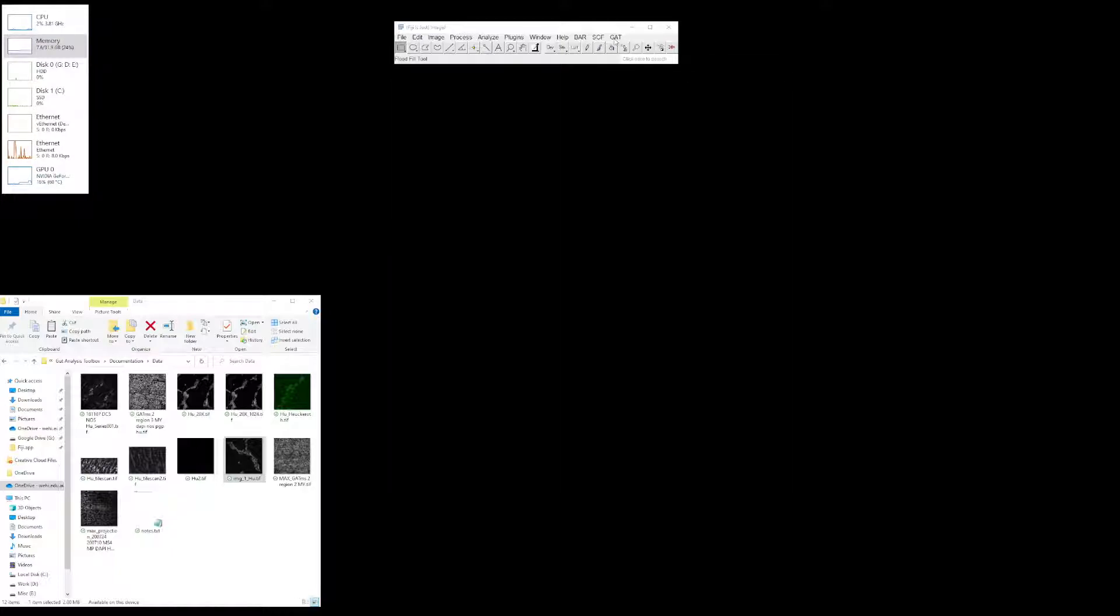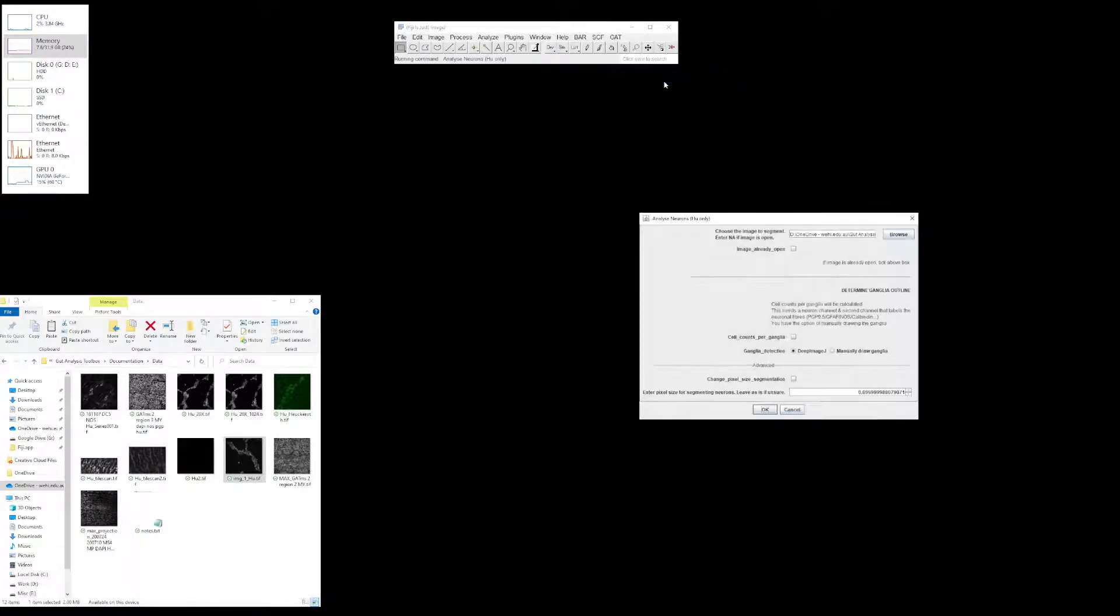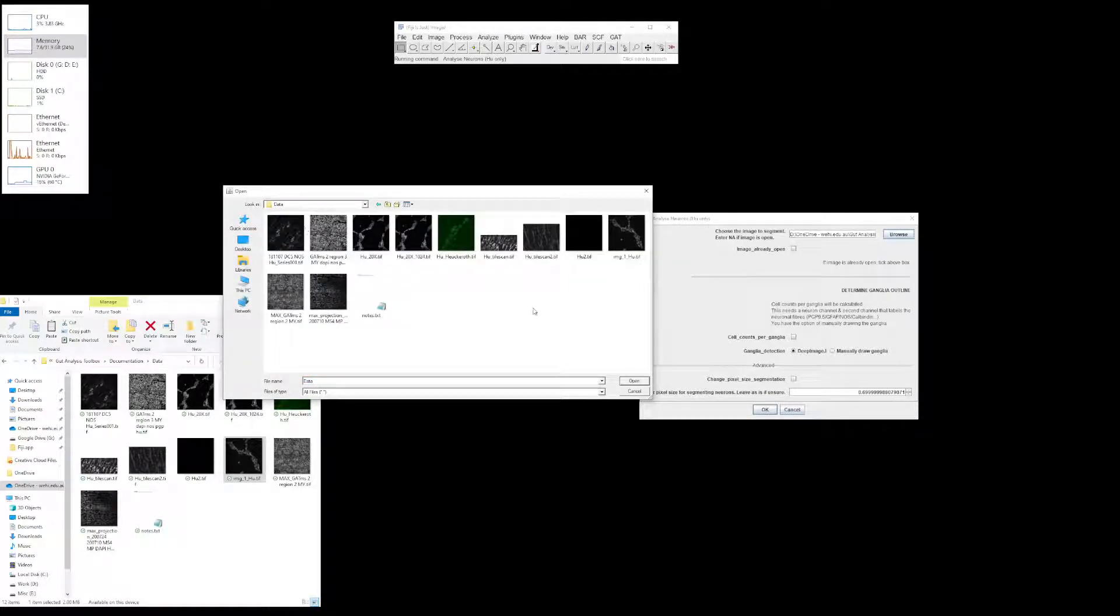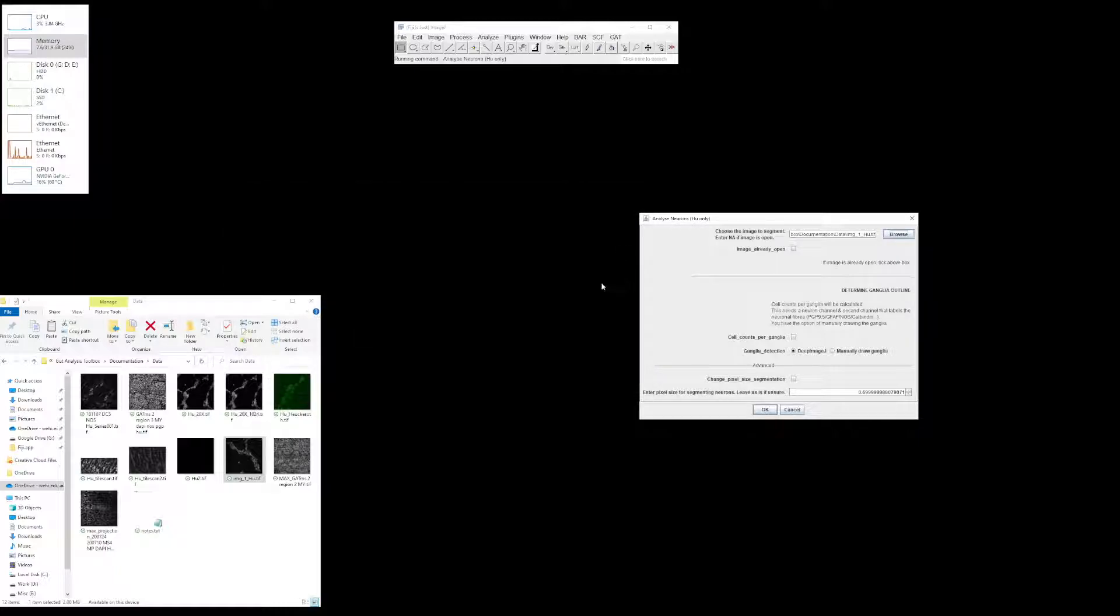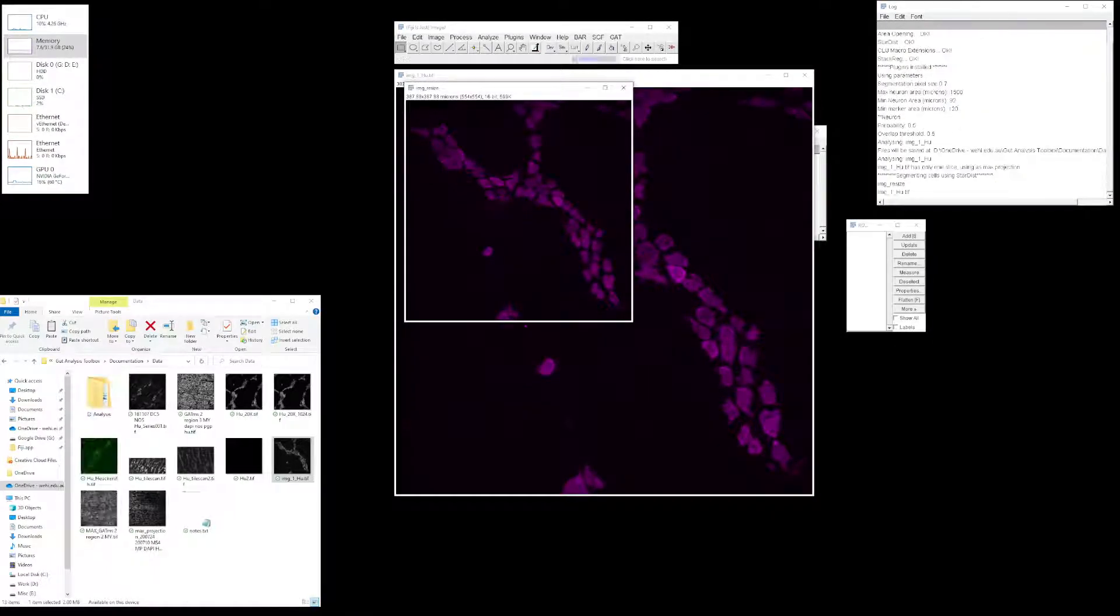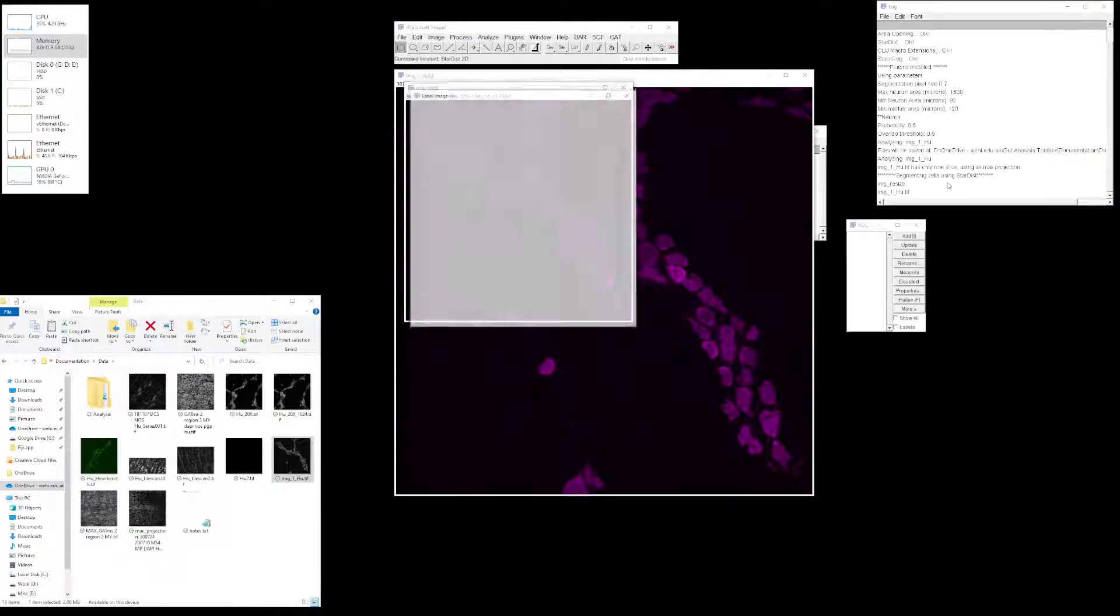If you want to run the segmentation, click GATT, click Analyze Neurons Hue only, and select the image location. You can see there aren't any folders here, but when you start running the analysis, it will automatically create a folder called analysis and store all the results in subfolders named after the file. Click OK and it's opening the image, running checks, and now segmenting cells.